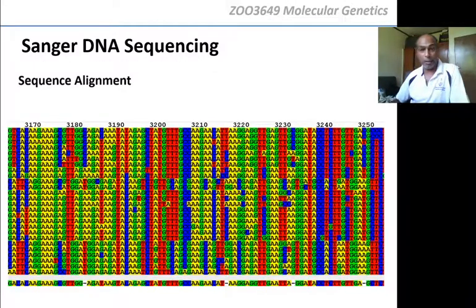It looks like this, what is on your screen right now. All right? Do you see that? You watch my mouse here. G, T, C, A, C, A, A, G, A, A, G, C, G, T, T, G, G, and so on. That's the sequence. This could easily be the sequence of COVID, right? These are the base pairs somewhere in the middle, around 3,000 base pairs into the alignment, okay? And you see here, each line is what?